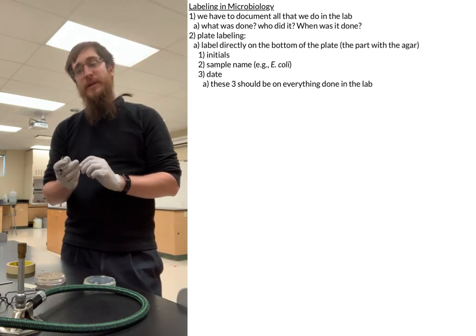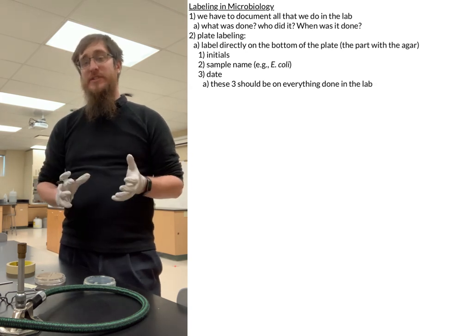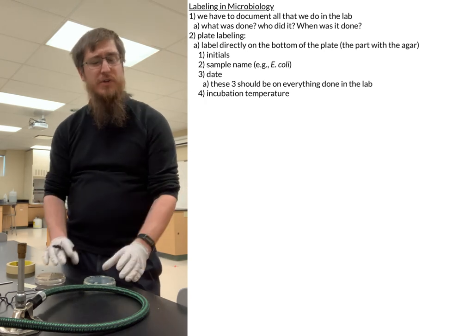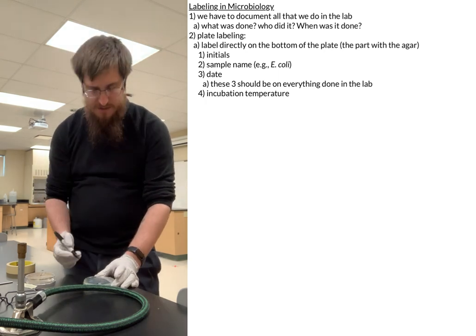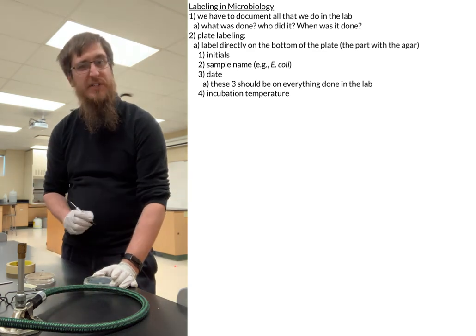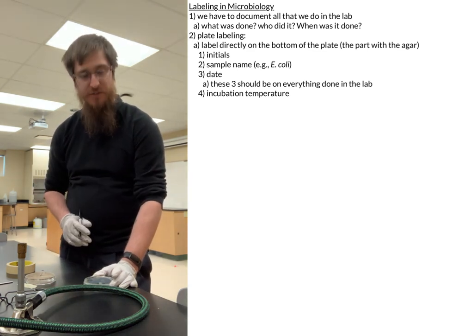Now, generally when it comes to plates, there are two more things we like to put on there as well. First of all, what temperature are we going to incubate this at? So I'm going to go ahead and put down 37 degrees Celsius, which is body temperature. That's a pretty standard one for growing stuff.